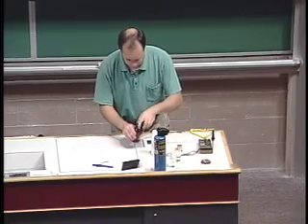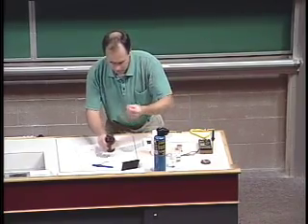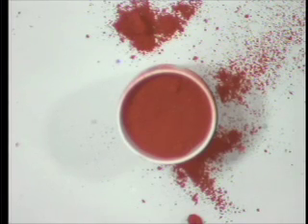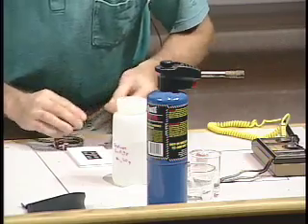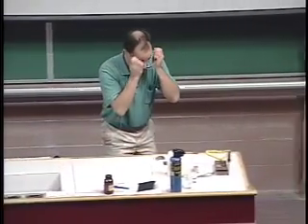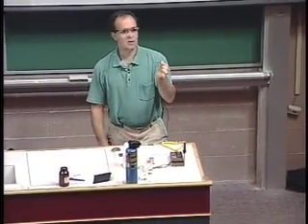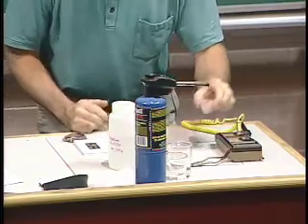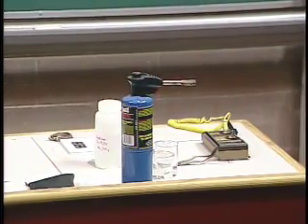And what I'll do is put it in this crucible here. So very finely divided — it's like flour, it's so fine. And you can see that not much is happening. I don't see any reaction going. I don't see any heat being involved. It should be 836 kilojoules per mole. Well, we've got to give it a bit of a kick in the pants. So you'll remember magnesium wire — this stuff burns. Let's call it a fuse, shall we? And I'm going to put that in here like that. And I'm going to put this in the sand bath here.